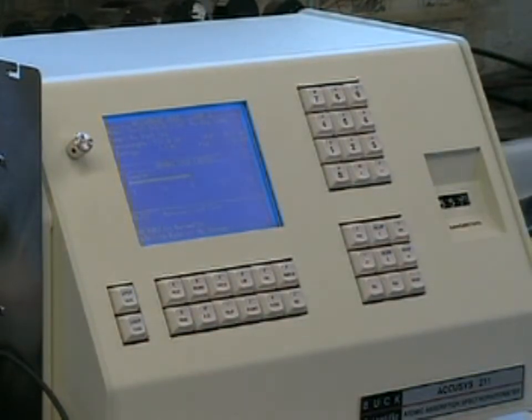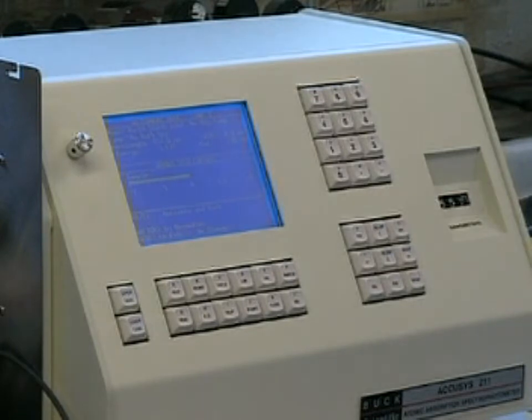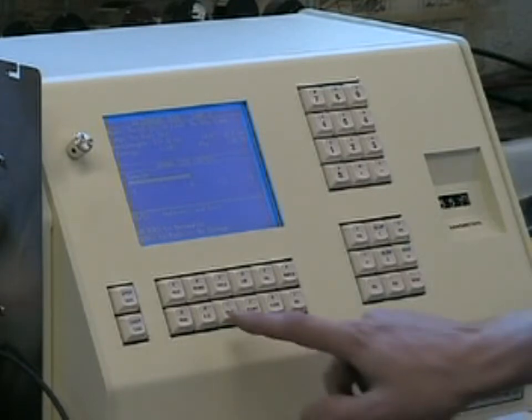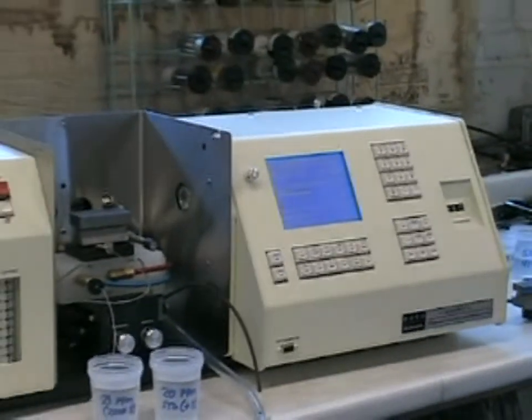There are some elements that do not utilize the deuterium background correction system because their wavelengths are above the recommended UV region of 440 nanometers. Barium at 554 nanometers is one of these elements, and this way you will only get a single bar graph line and a single energy value for the hollow cathode lamp itself. Once this has been optimized, press the Auto Zero key to return to your active analysis screen.